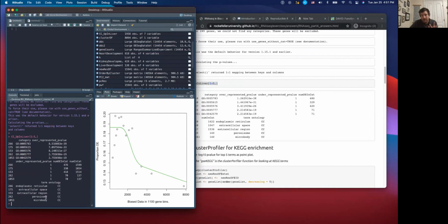And you imagine there's a lot of specific things related to the liver, like to do with processing and secretion and all that jazz. And so I think that's really what's manifesting here, and that's why we see these.